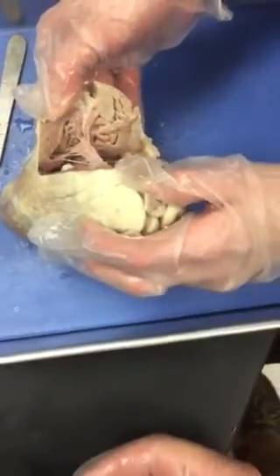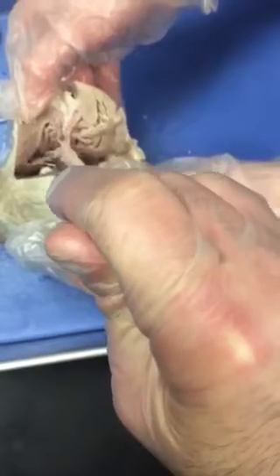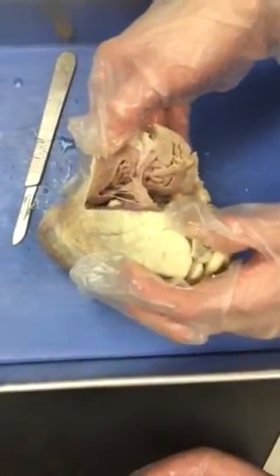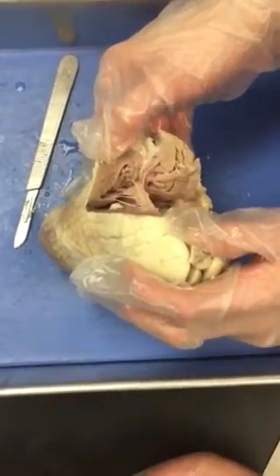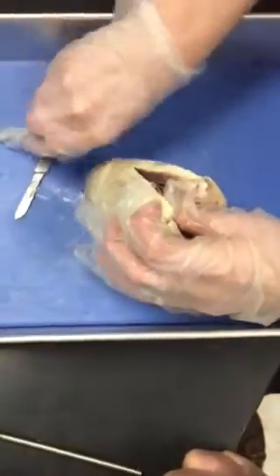33, gently tug on one of the chordae tendineae and observe what happens to the valve. 34, describe the function of the tricuspid valve in the space below. 35, use the scalpel to make a long incision through the wall of the left ventricle.